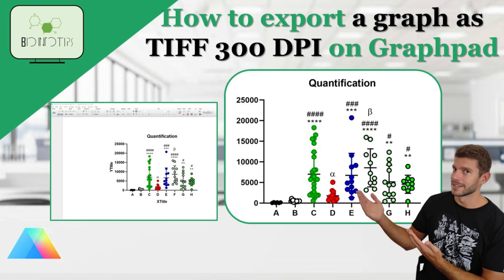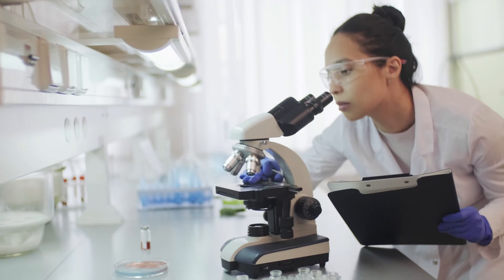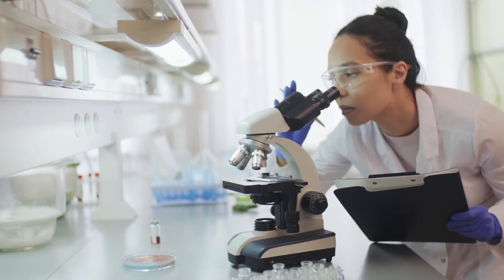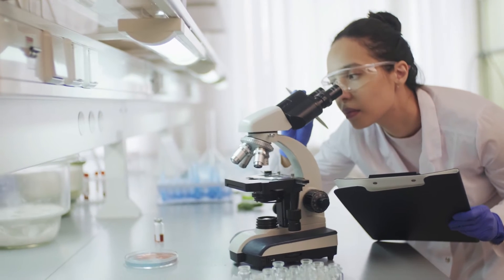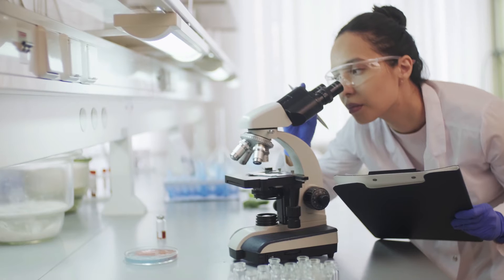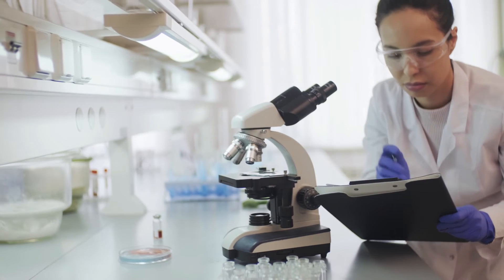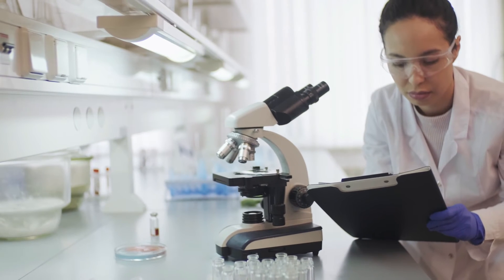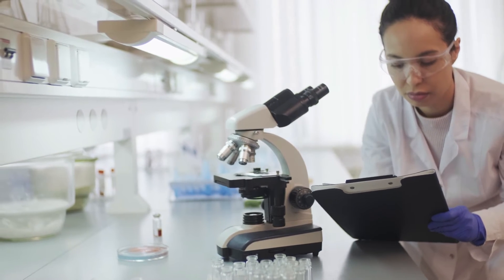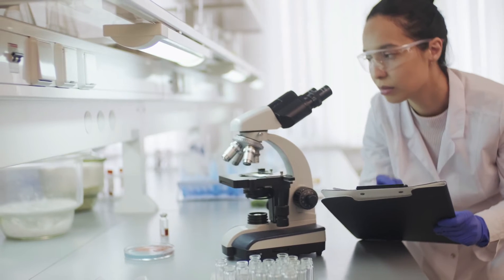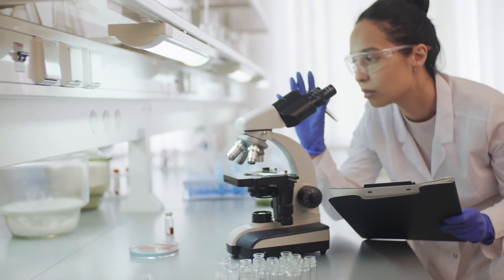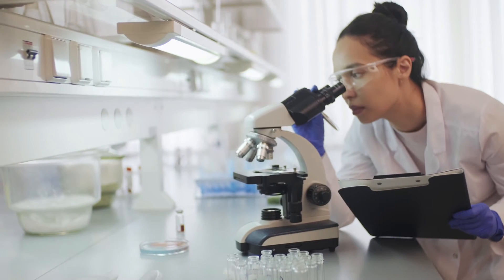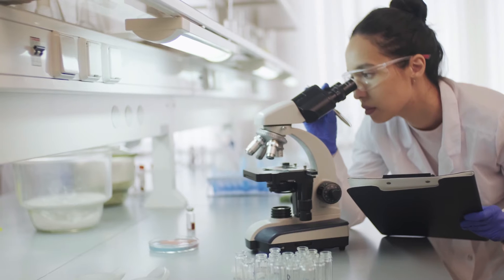Hello everyone, and welcome back to BioInfo Tips. In today's tutorial, we're going to learn how to export a graph as a high-resolution TIF file with 300 dpi using GraphPad Prism. This can be especially useful for scientific posters, publications, or any situation where you need a high-quality image of your graph. Let's get started.